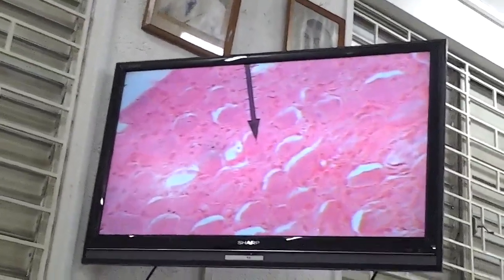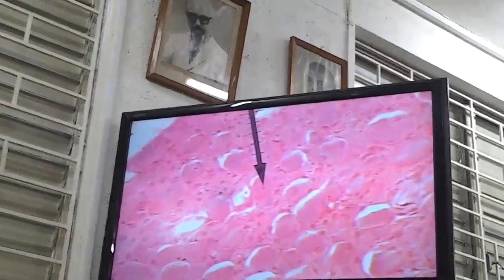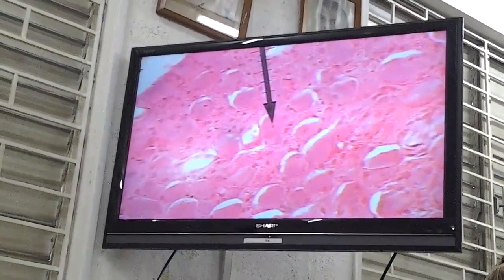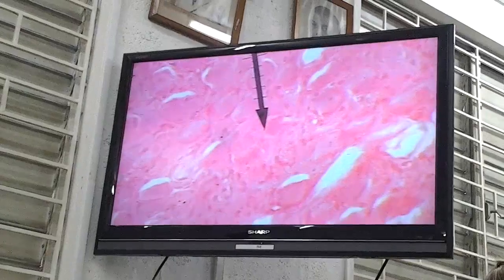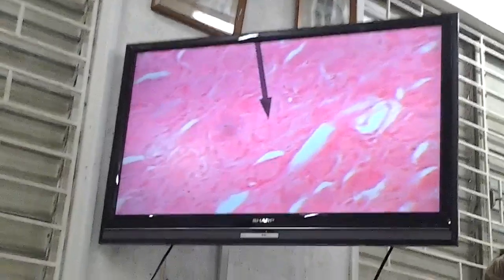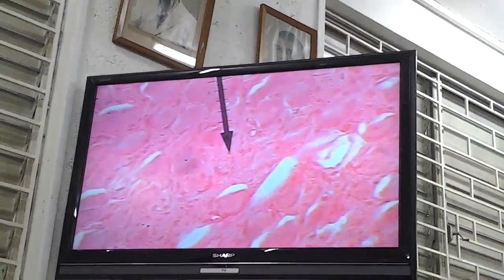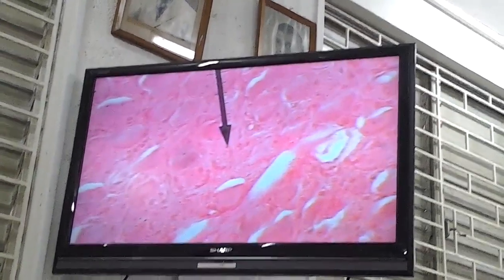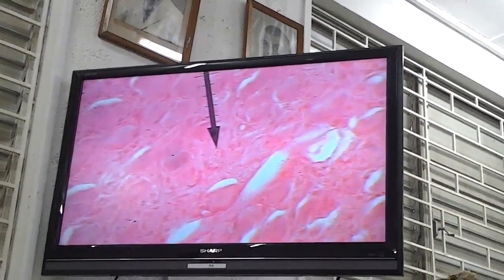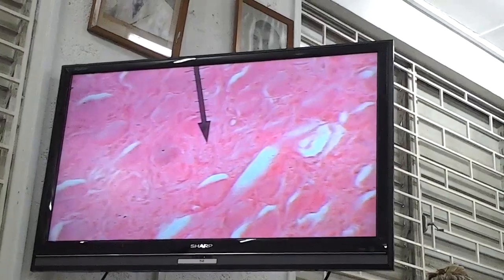Okay, this ganglion is in fact one that is situated right beside the suprarenal gland. Okay, and the ganglion itself is a cell body that's a nucleus. And we're seeing a lot of nerve fibers. So these are axons that we're looking at right here. So lots of little axons right here, and there. So lots of them. You can see them. Look like some little straws. Look at that. Right at the tip here. So these could be some pre or post ganglionic fibers that we're looking at right here. Okay. So pre or post.